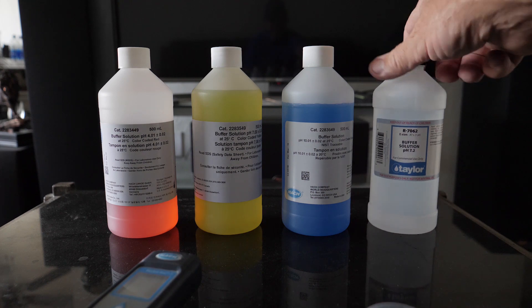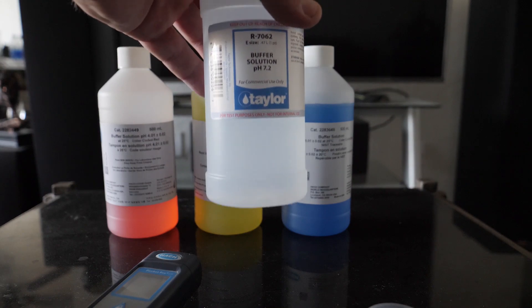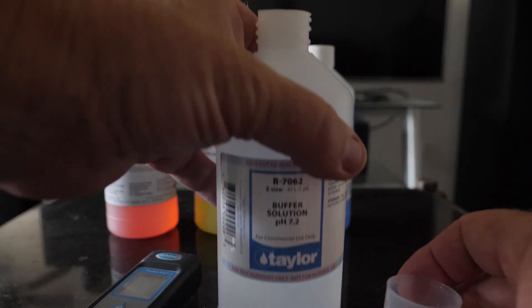Okay, let's get started. We're going to first start off with the Taylor 7.2 solution.